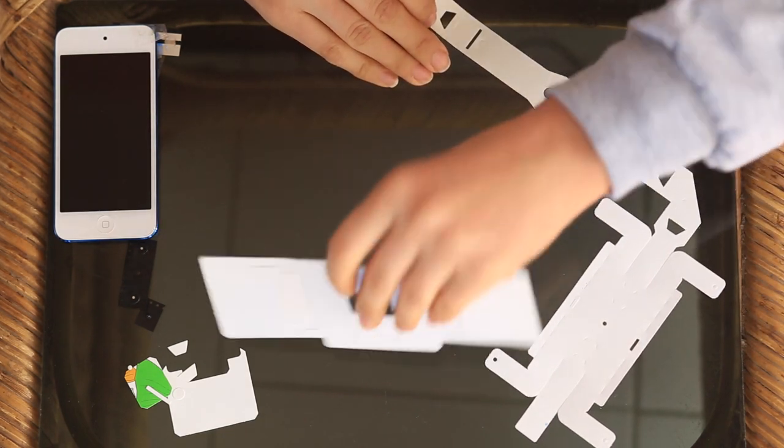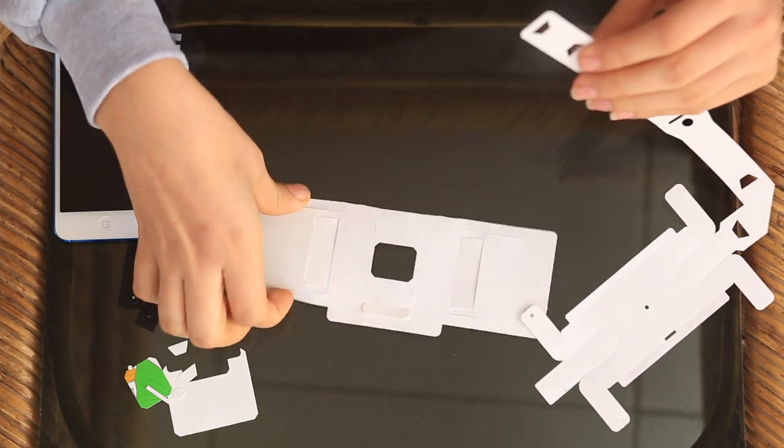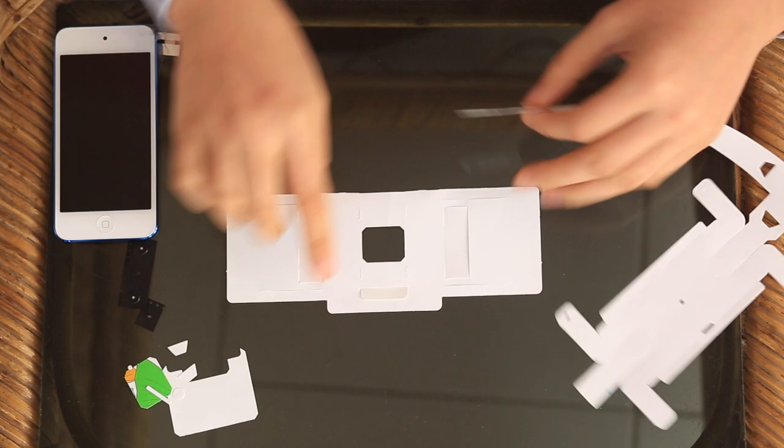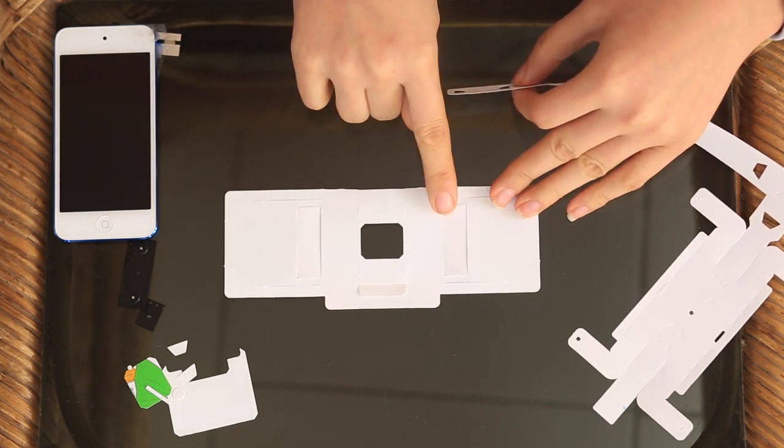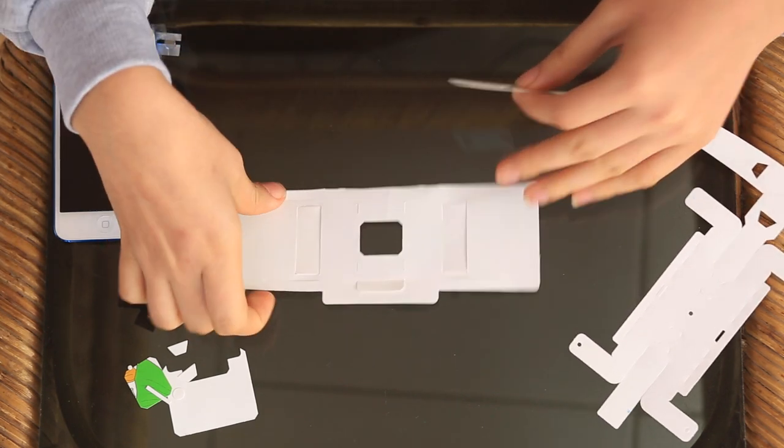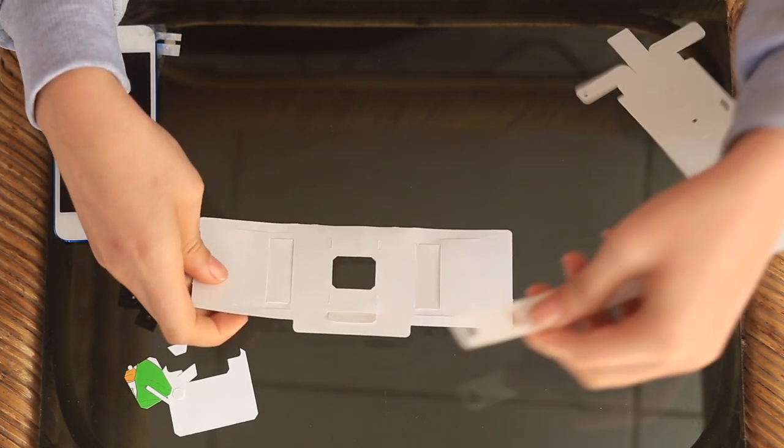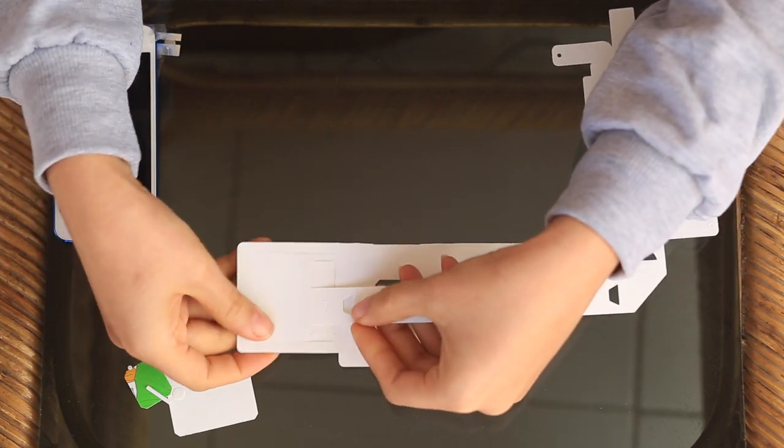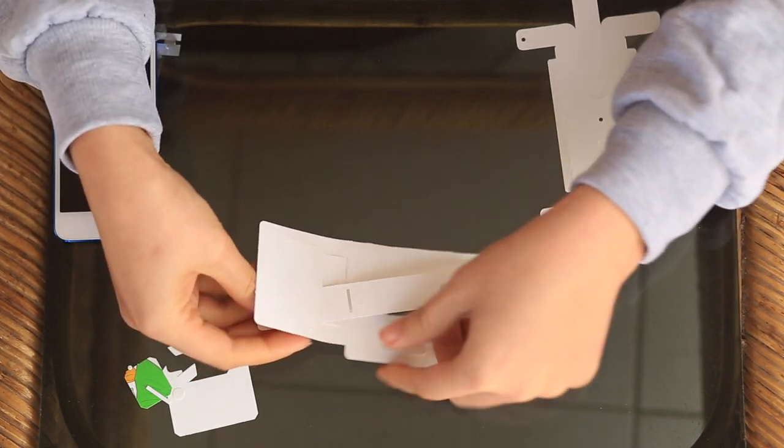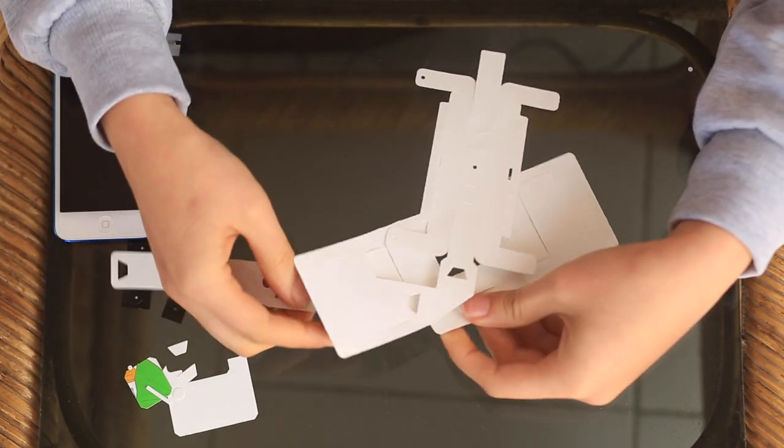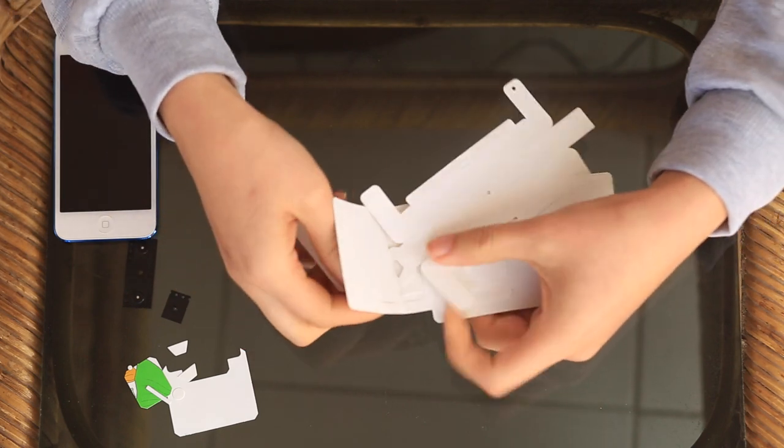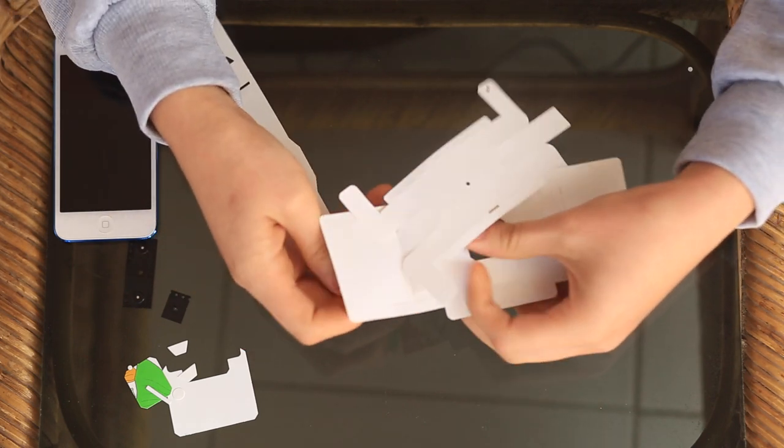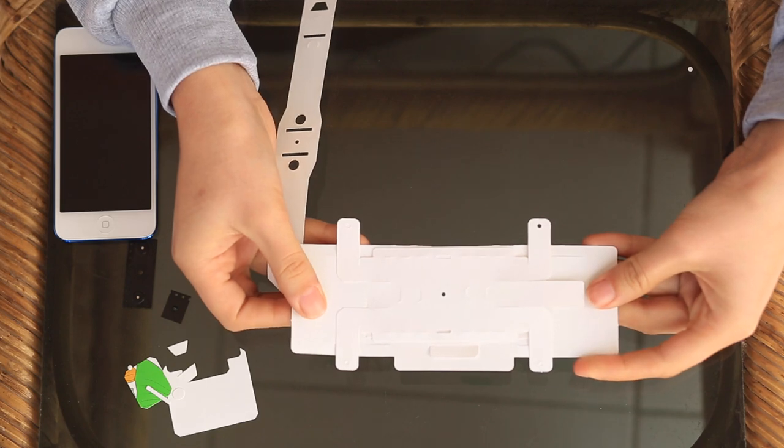You fold this to the back. There's four slots in the back of the Foldscope. One, two, three, four. Take the tail of the turtle and you put it through the last slot. All the way through until it doesn't go anymore. And he turns the corner and he lies flat.